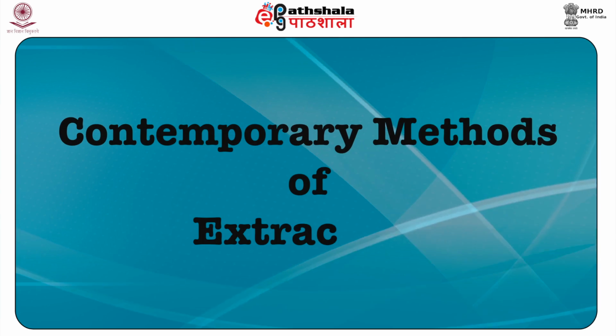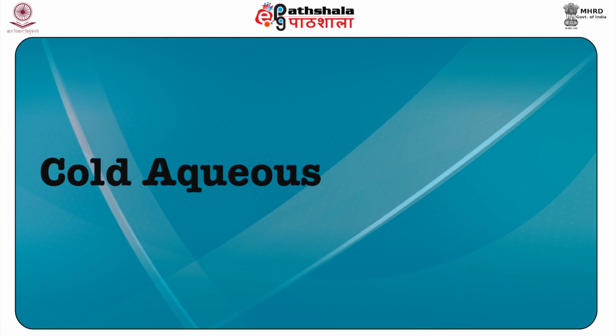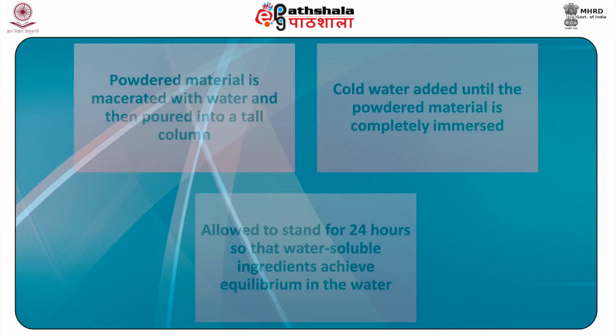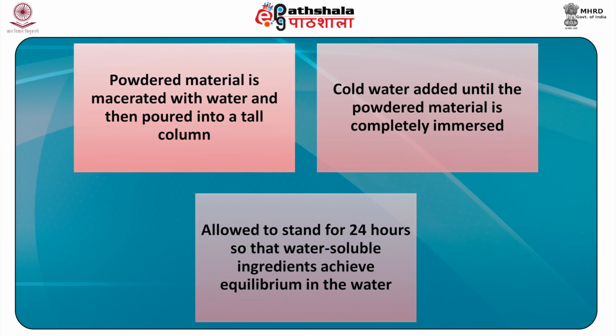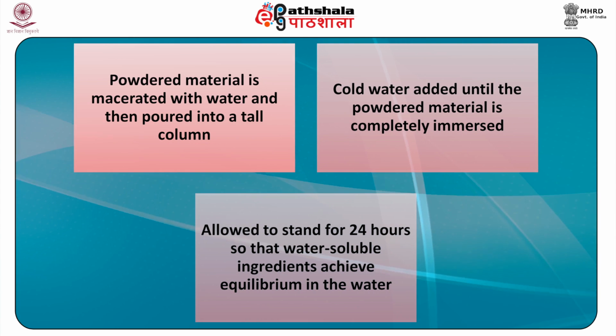Next, we will study the contemporary methods of extraction, starting with the first, cold aqueous percolation. The powdered material is macerated with water and then poured into a tall column. Cold water is added until the powdered material is completely immersed.